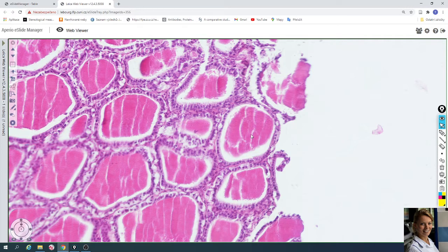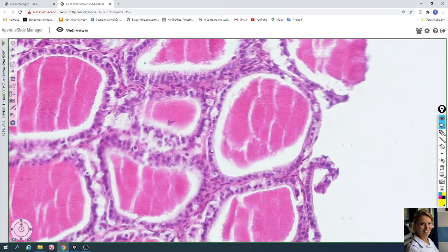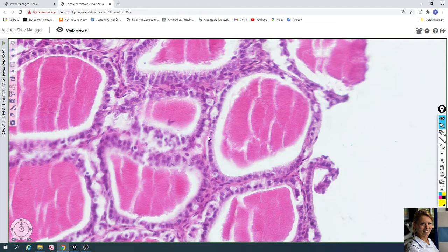The follicles are lined with one layer of cuboidal cells called follicular cells. This is a single layer of cuboidal cells with round nuclei — it's called follicular cells.